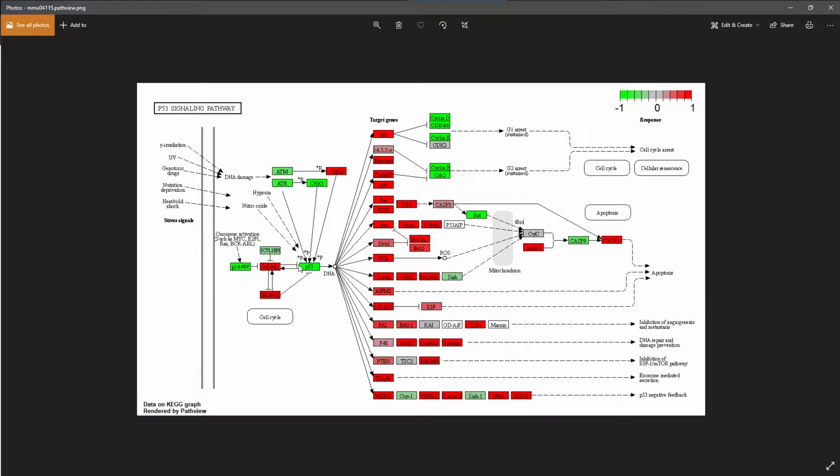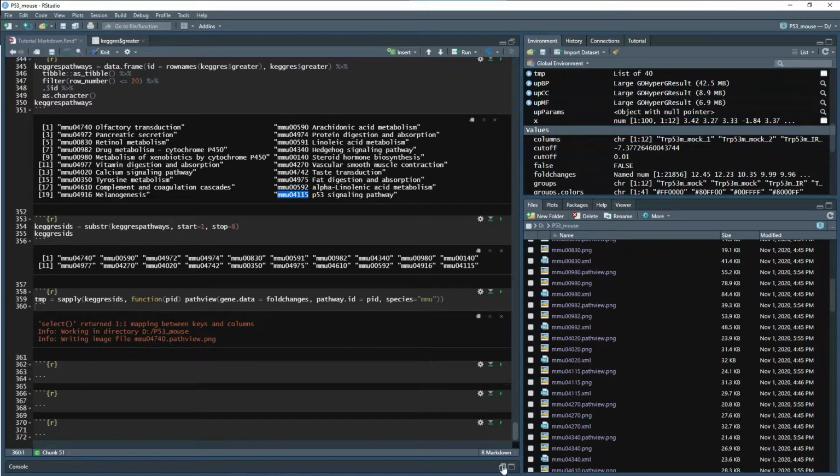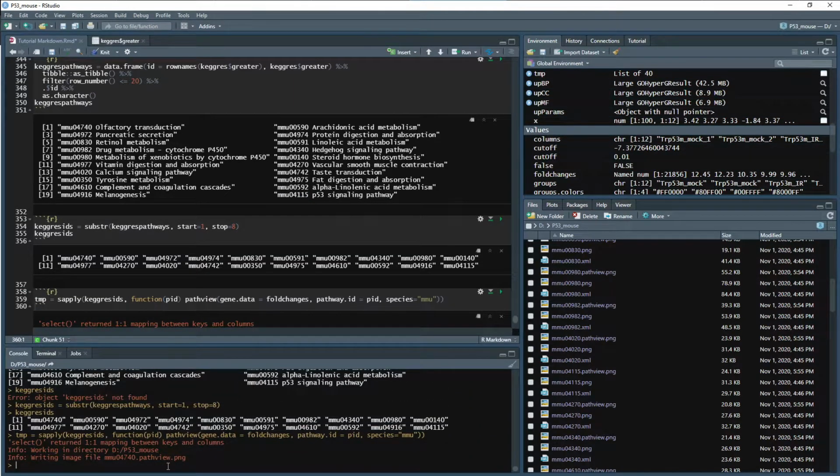And I looked at the results table with the log fold change, and log fold change is actually negative, which then got me also looking at what's actually happening there. So everything else but P53 is being upregulated, but P53, between the two, it's really kind of messy with your head, but let's just look at it to get an idea of how to explain it. So look at DDS, and then the gene. I already know what the gene name in the results or in the DDS is.